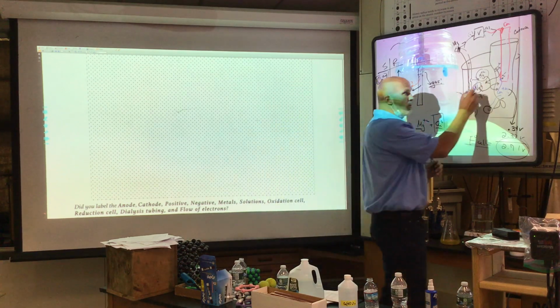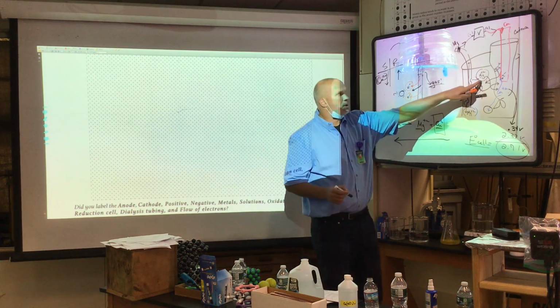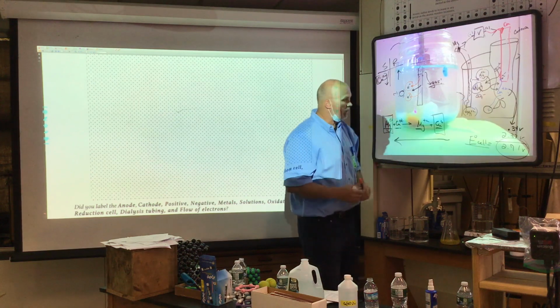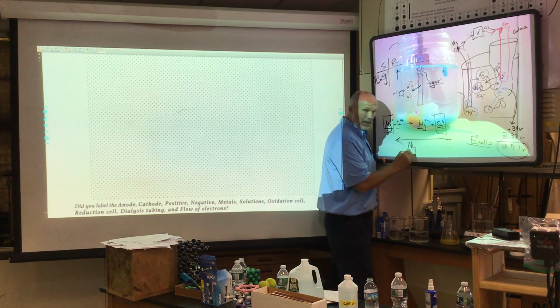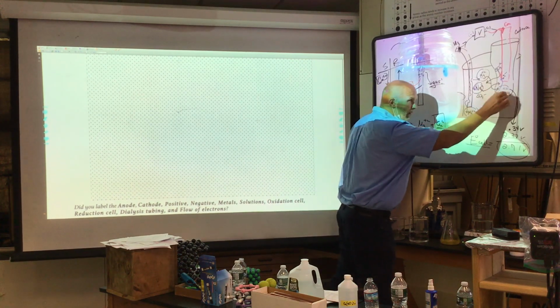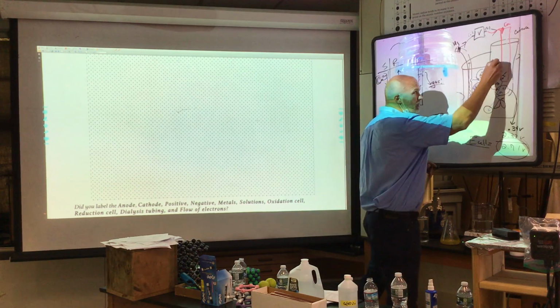Well, we know that sodium comes in there. Well, so does who? Magnesium's coming in there too. Now let's think about this for a second. If magnesium goes into the bag as a plus 2 ion, what ion is in there? Okay, I'm sorry. Copper plus 2 and what else?